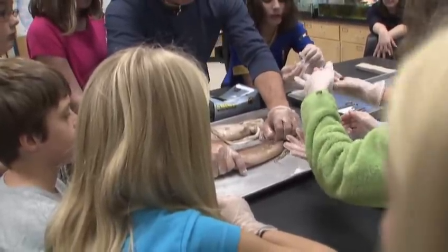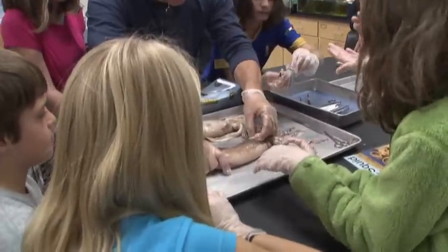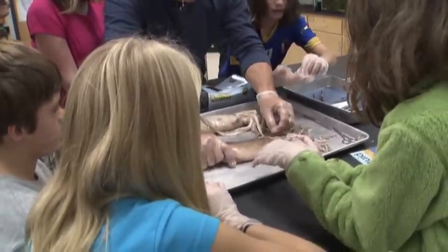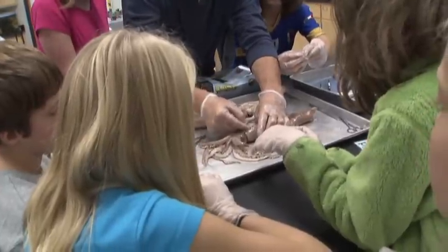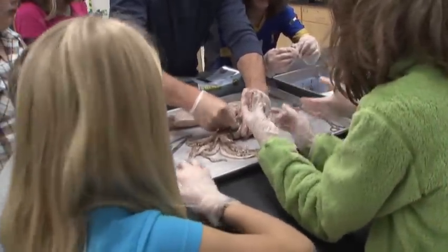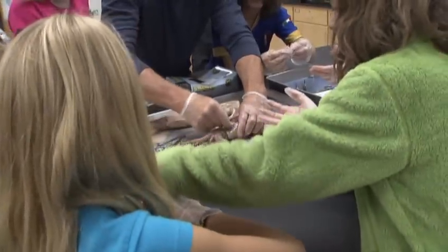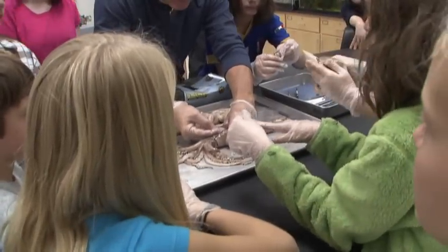Not getting it. Do you need to use the pen? No, it's a remnant of the shell. Now I'm breaking it up. Courtney, I'll have you cut this. Okay. Here, I'm going to pass that back to you. Could we have a paper towel? Maybe just put it in the corner or something, so it doesn't get in the way of that section. I really kind of massacred that thing.